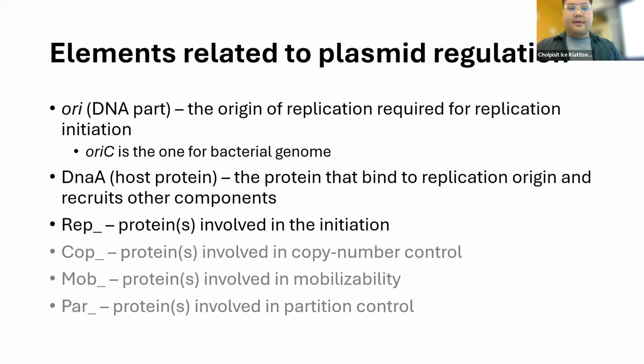All right. The other thing that I want to go into specifics a little bit is that when you take the plasmid DNA and look at it in your computer, you get the random text of DNA, ATGC, and you'll be annotating them as this is part A, part B, or whatever. Most of the time, you see some common parts in those plasmids where they'll be labeled as ORI, or the origin of replication.